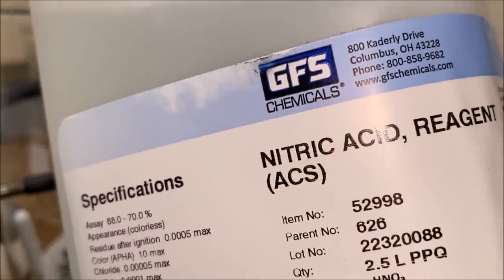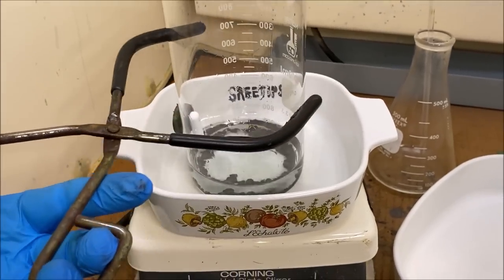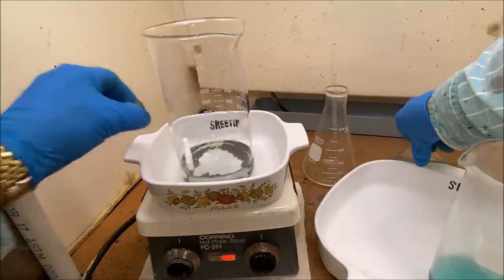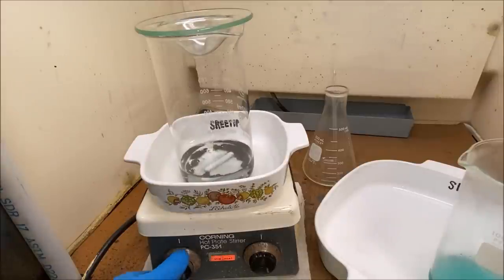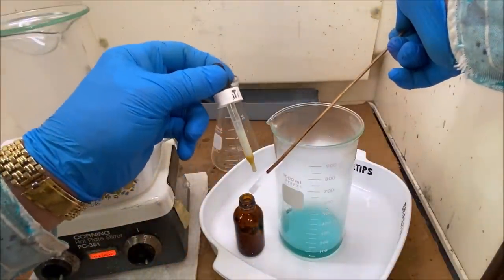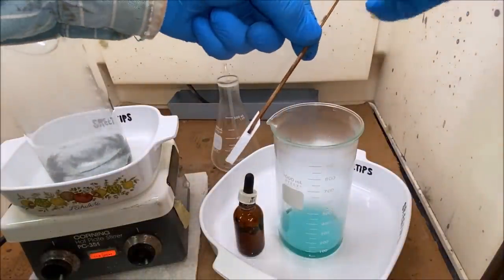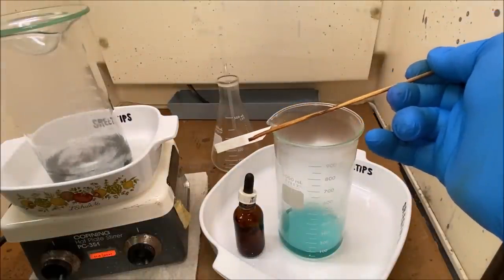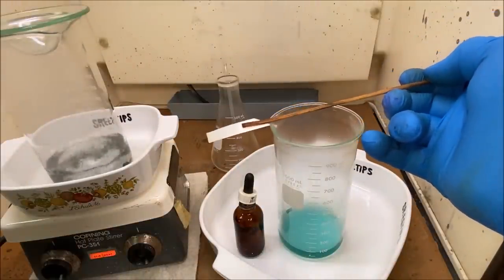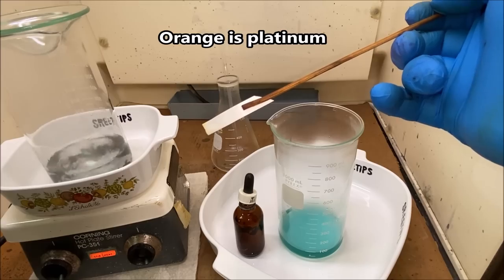I'm adding a little bit more nitric acid. And now we'll put this up on the heat again. Now we'll just keep doing these nitric boils. I'm going to reach down in here and get a little bit of this on our filter paper. See if we've got any precious metals in solution. I don't see anything. Maybe just a little tiny hint of orange, but nothing significant.